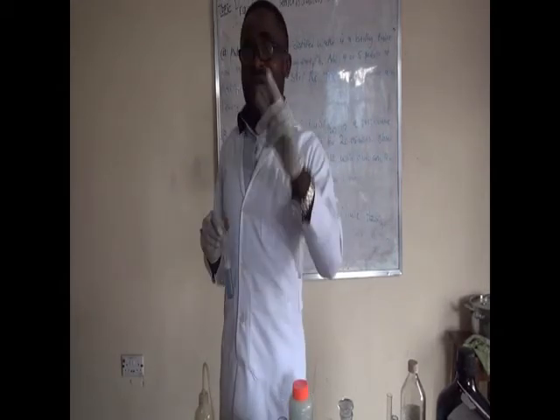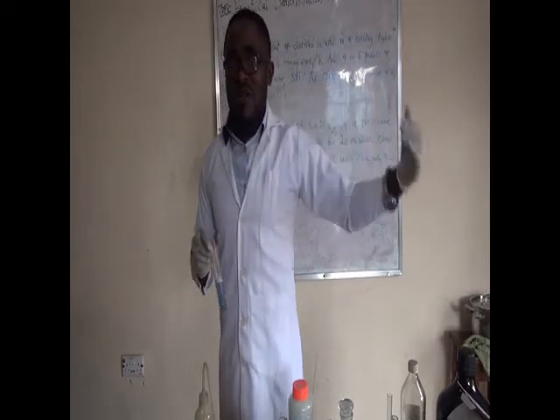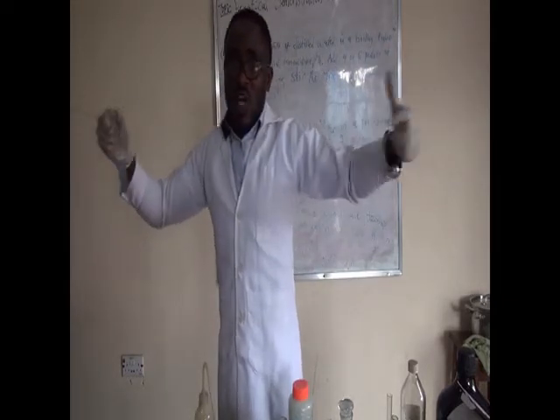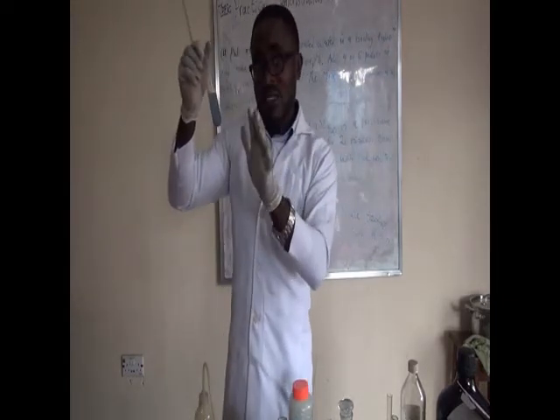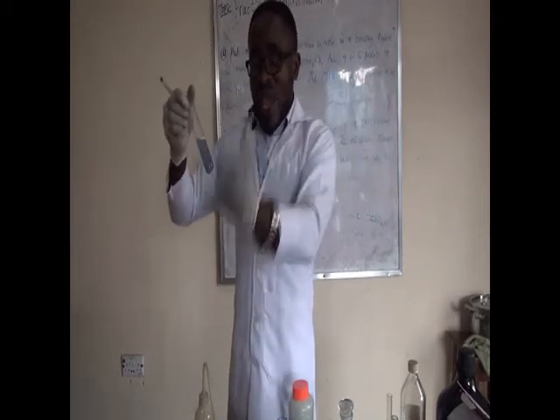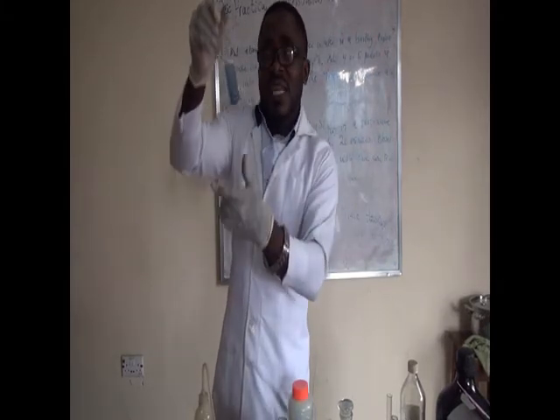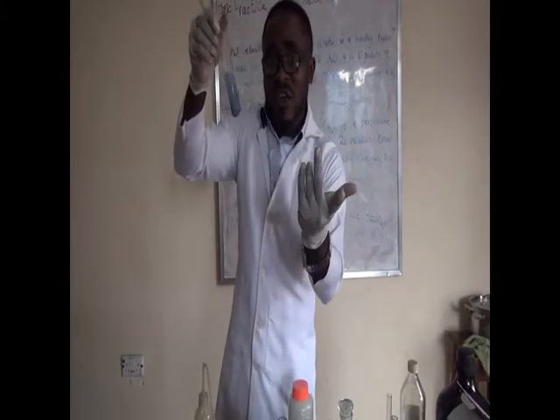This is an open system, and you can see heat is being exchanged between the system and the environment. All the sodium hydroxide pellets have completely dissolved in the water, and heat is being given off to the environment.